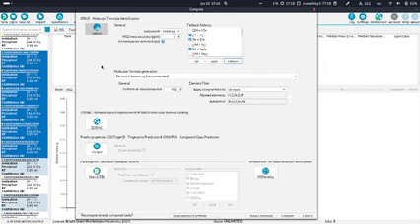Another question? There's also the option to choose minus H2O, so minus water, which might be an in-source fragment. How is that distinguished? So M plus H and a possible in-source fragment of that. I mean, for the molecular formula annotation, it changes not much. It changes then the structure database search, if you look into the neutral formula or the neutral formula minus H2O.